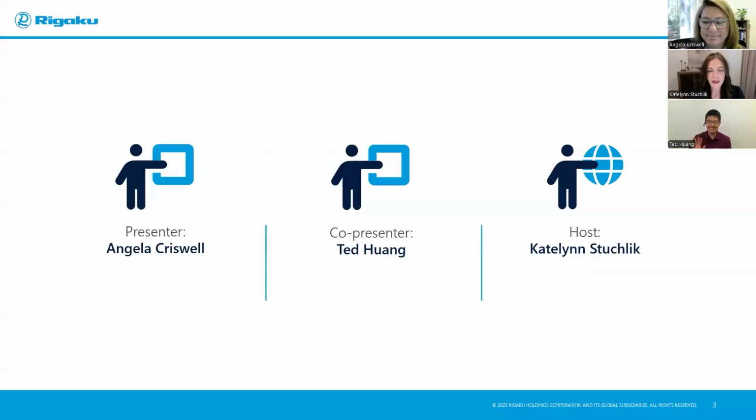Hi, everyone. Thank you all for attending Rigaku's webinar series, Mastering CT, Advanced Techniques in Practice. In this webinar series, we will discuss advanced X-ray CT methods to overcome common challenges, including high-density samples, repetitive routine work, and dynamic CT measurements. In this episode, we will be discussing automating workflows for X-ray CT.